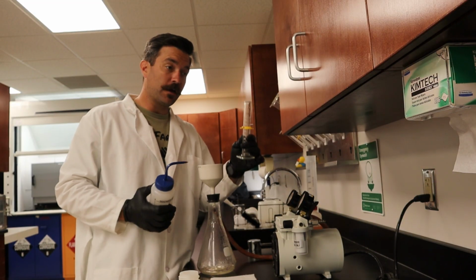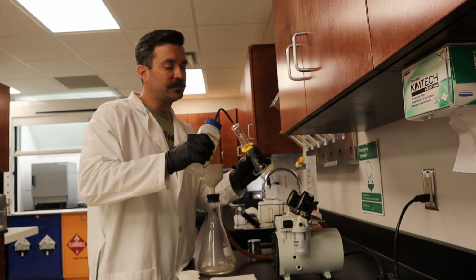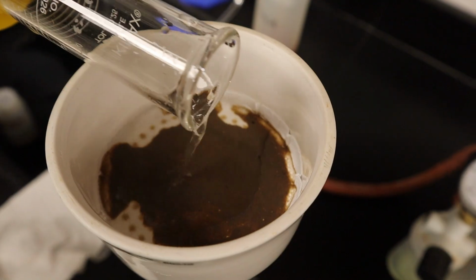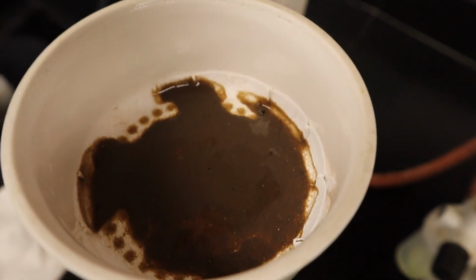But next, it's very important that you rinse this out 3 times and you get all the solids that may be on the sidewalls there. And then I'm going to pour it right back over onto my sample. We're going to do that 3 times.